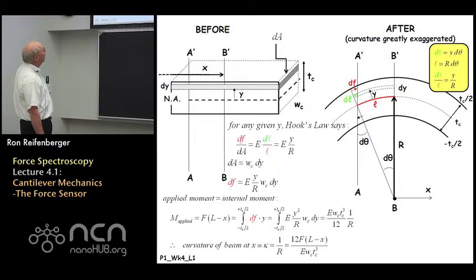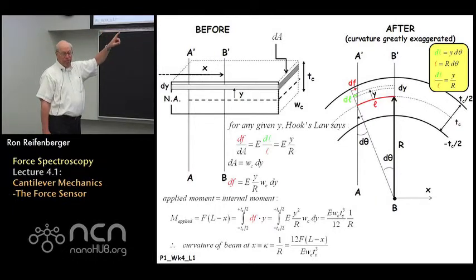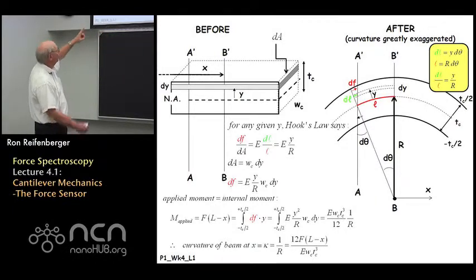What you have to then do is look carefully in order to interpret the right-hand side of Hooke's law. You need an expression for delta L over L that characterizes the rectangular area that I've indicated.